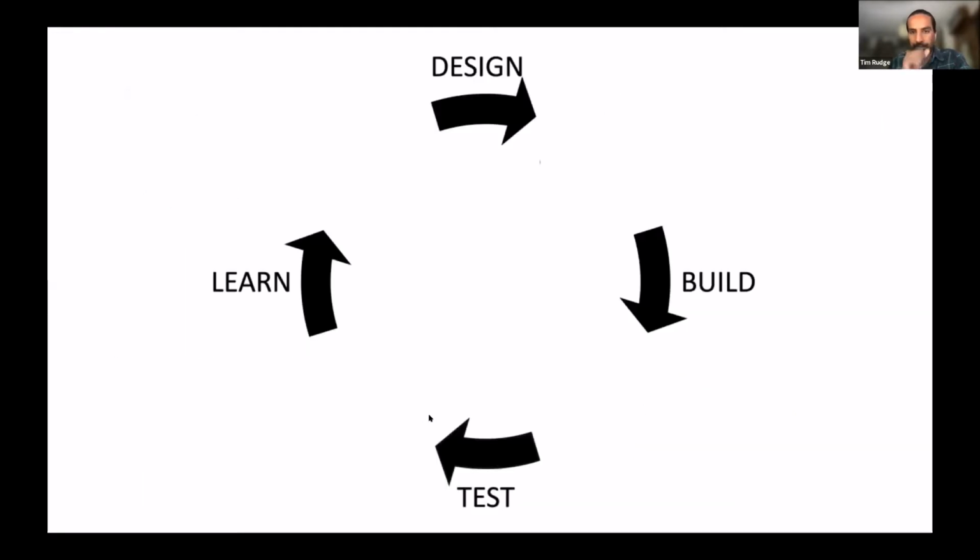So we're interested in the design, build, test, learn cycle, as you know, the standard approach. A goal of synthetic biology is to develop tools and methods for each of these phases of the engineering cycle, to make it as efficient and as effective as possible. For example, using automation and different types of software tools to join up these different phases of the design cycle.